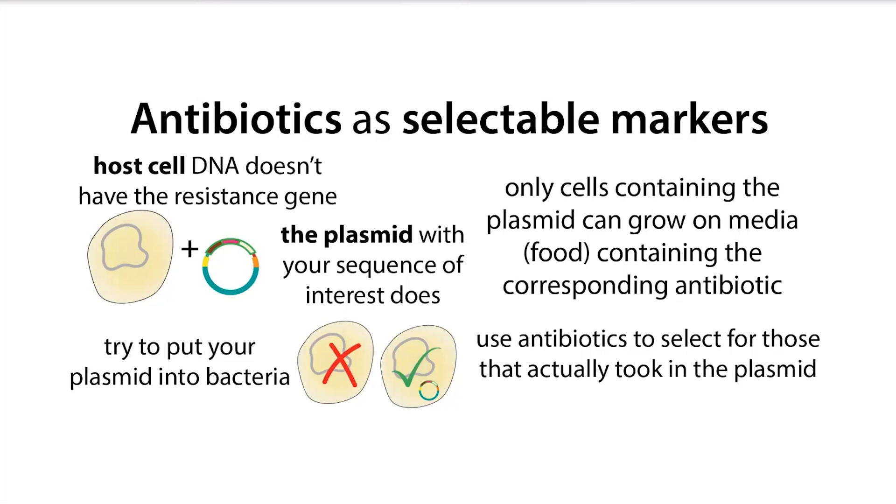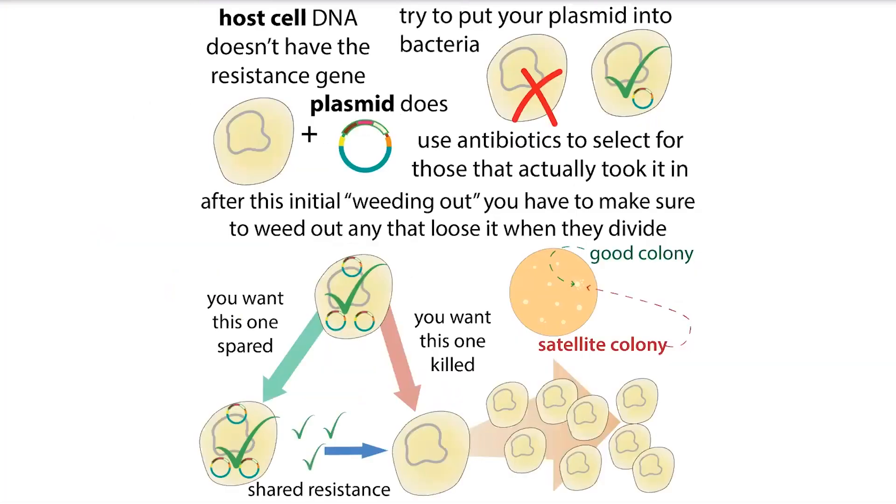The problem with satellite colonies is that these cells are not going to have that antibiotic resistance gene. They're just kind of piggybacking off of the excreted resistance from the nearby bacterial cell, which is a problem with ampicillin and other beta-lactamase resistance genes because those products are going to be secreted.